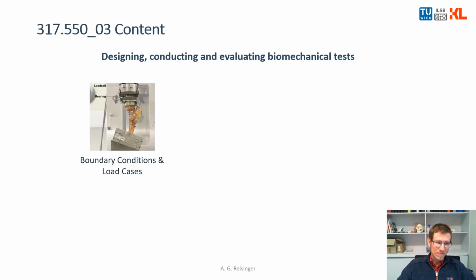Today, we are looking into more practical aspects of the mechanical testing of bone and implants, and we will talk about the steps that need to be considered when planning such experiments. A very important part is thinking about and designing boundary conditions and load cases. This will be the biggest part for today.